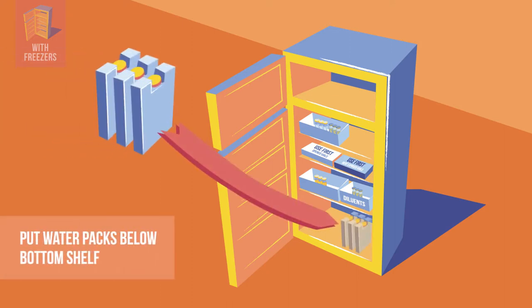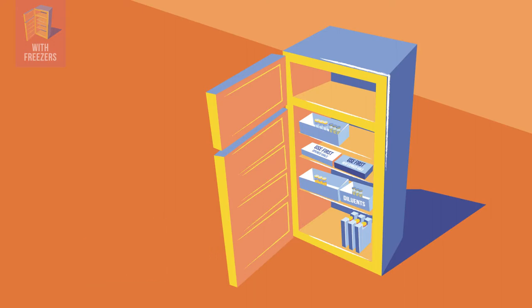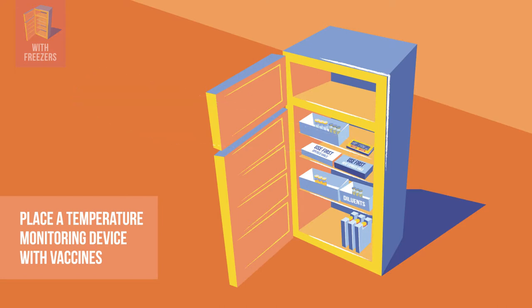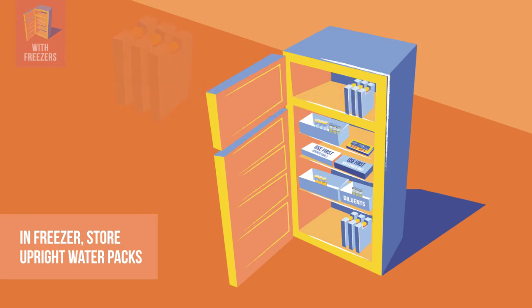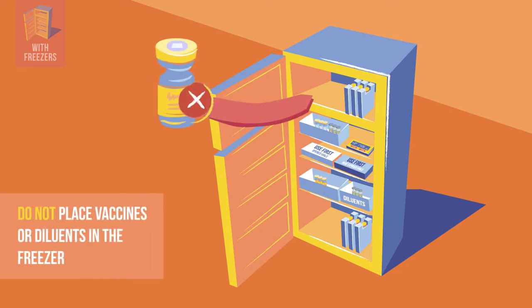Water packs are placed below the bottom shelf to stabilize the temperature in case of a power cut. There is also a 30-day refrigerator logger placed with the vaccines. Your facility may use a freeze indicator and thermometer instead. Only ice packs are prepared and stored in the freezer compartment, and they are placed upright to avoid leaks.